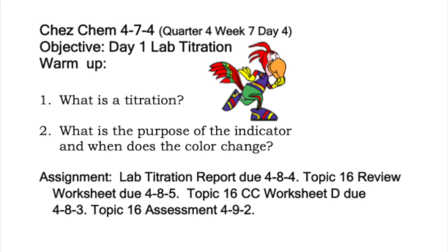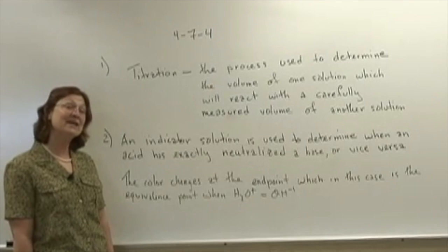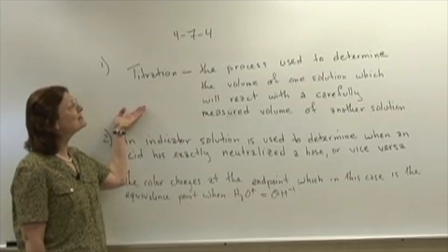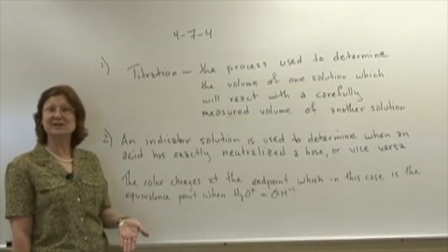I am so excited today because we're going to do a titration lab. Let's do the warm-up questions as quickly as possible so we can move on to the lab. These questions are answered in the discussion portion of the lab. A titration is what we are doing today. We are going to begin our titration today and go on and complete it tomorrow.